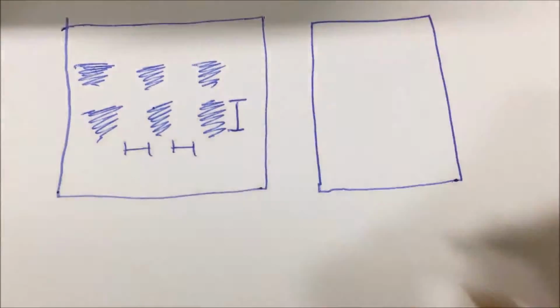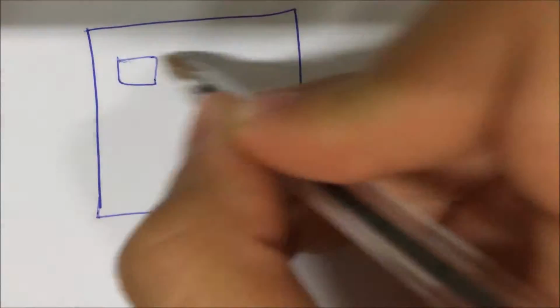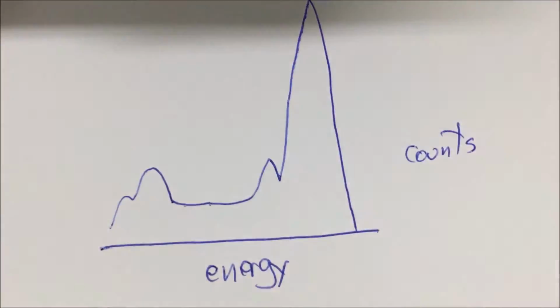One of my experiments was to try to make the modifications as small and as close to each other as possible. Chemical analysis was done on the modifications to figure out what elements were being removed from the surface. The X-ray emission from the modified surface and the unmodified surface were compared. This is what the output looked like.